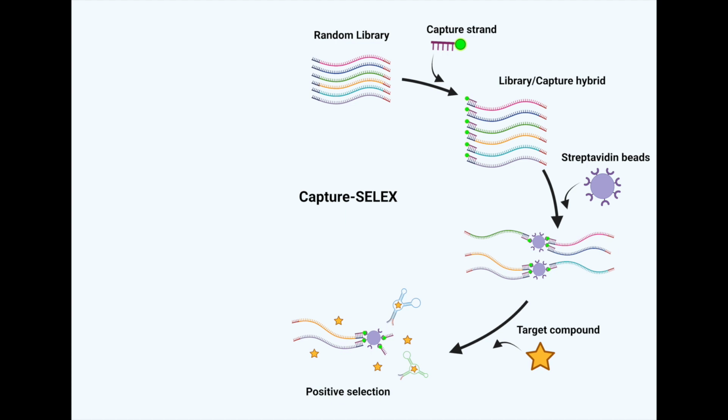Okay, so what's next? You have this solution, and it has a lot of good potential aptamers, but then what do you do? In the first round, remember that the initial library is completely random, so there's basically only one of each sequence. What we want to do next is called amplification. This quickly and efficiently replicates the DNA, so there's many copies of each sequence with the potential to be an aptamer. If we don't do this, it becomes incredibly easy to just lose an important sequence.